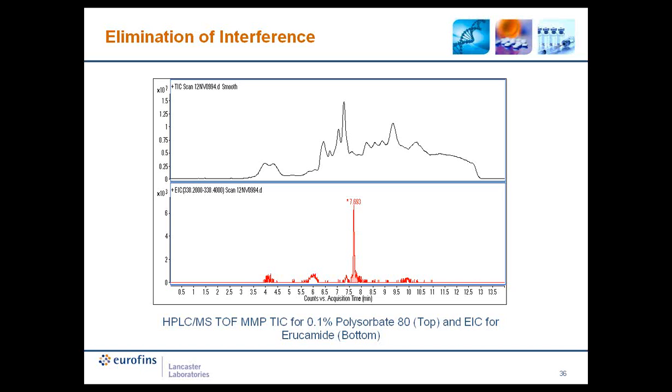Extracted ion analysis may be beneficial when performing a simulation study with a complex matrix or when a model solvent is used in conjunction with a surfactant-containing solution for the initial extractable screening. The use of a model solvent allows for detected extractable compounds to be extracted in more complex matrices to ensure that extractable compounds are not missed.